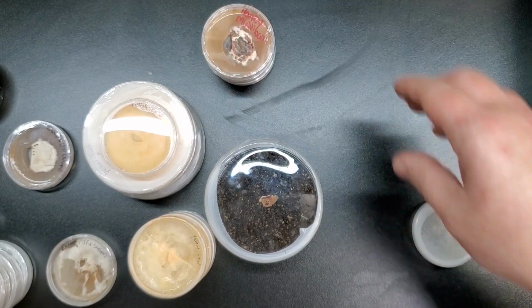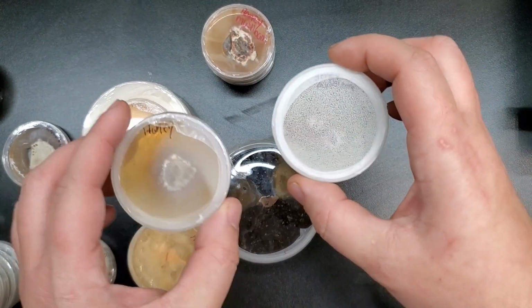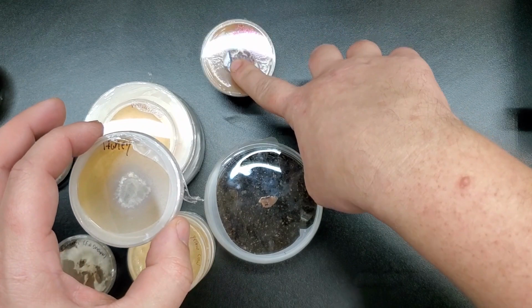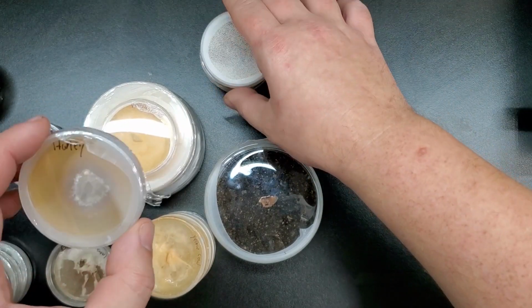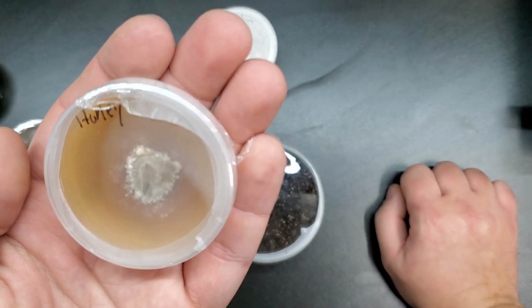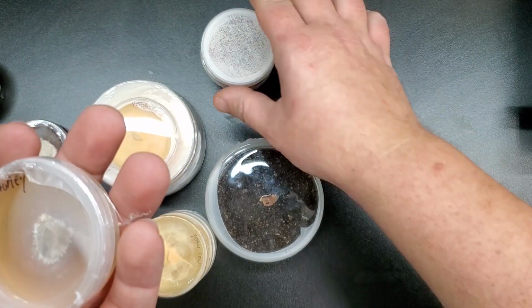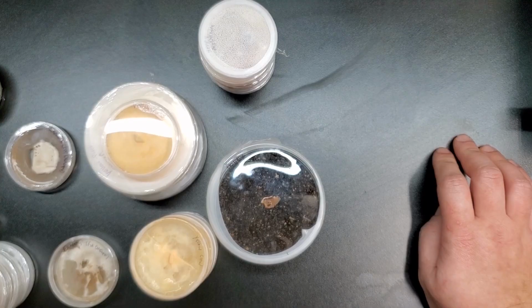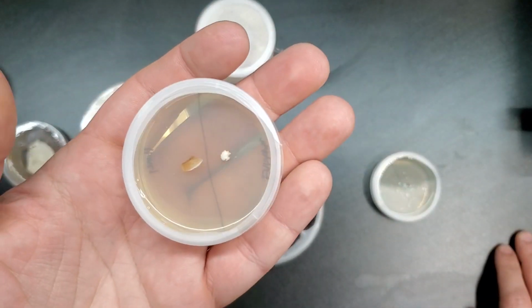Really all I have to say about the honey mushrooms, these two honey mushroom Petri dishes here are just other tissue transfers that I did from the original Petri dishes right here. And they're doing just fine. It just seems that honey mushrooms tend to be a little slower growing than what a lot of other mushroom species are, that's just the way they are. Nothing wrong with that.